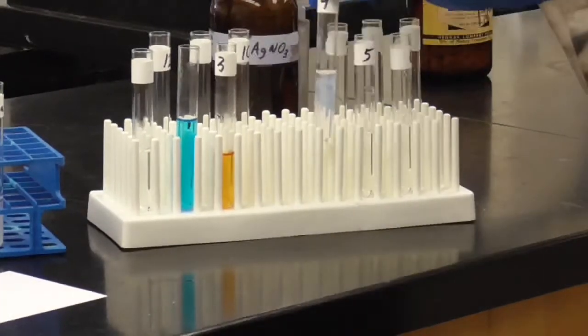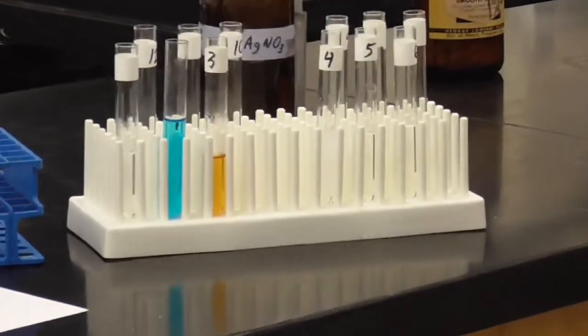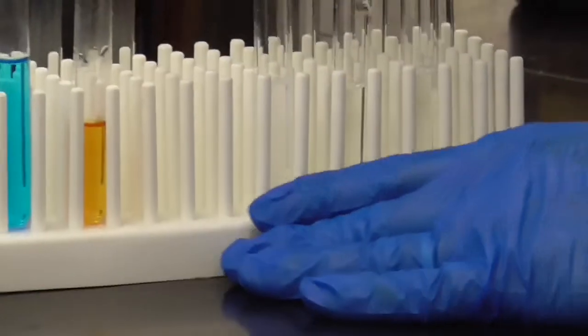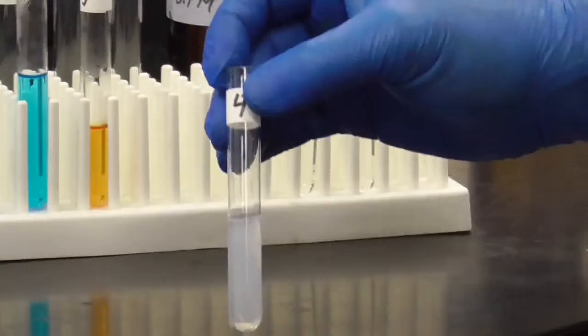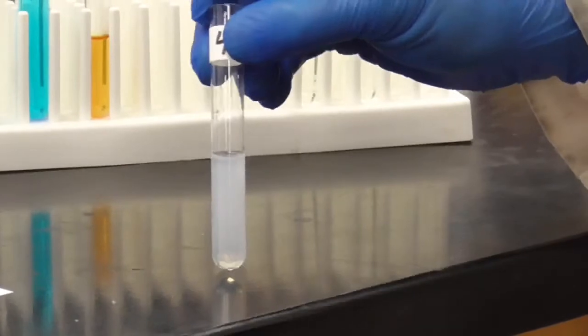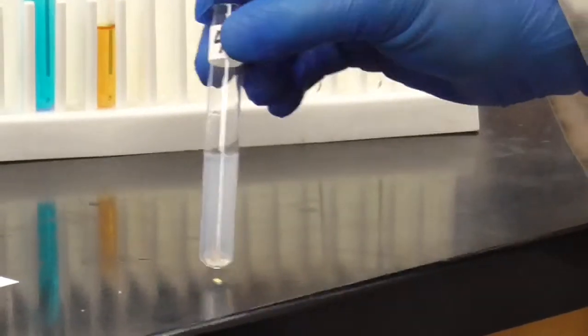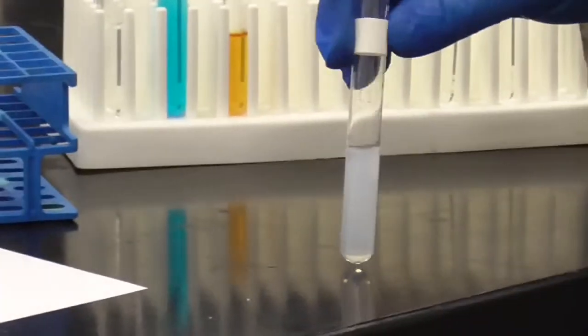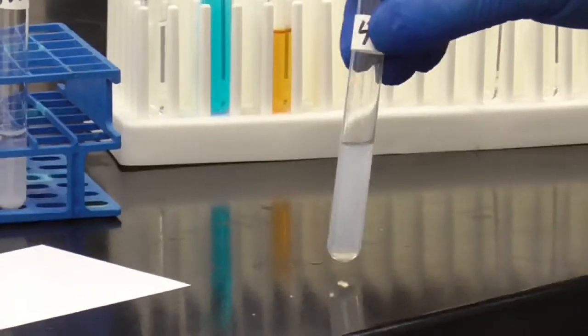And take a look at that. This is kind of interesting. It might be kind of hard to see on the camera. Let me put it against the black, perhaps. That might be a little bit easier. All right. We don't get a lot of precipitate, but you can see it's definitely cloudy. Very similar to the positive over here. All right. And so after 15 minutes, we do have evidence that the chlorides are crossing the dialysis bag. Cool.